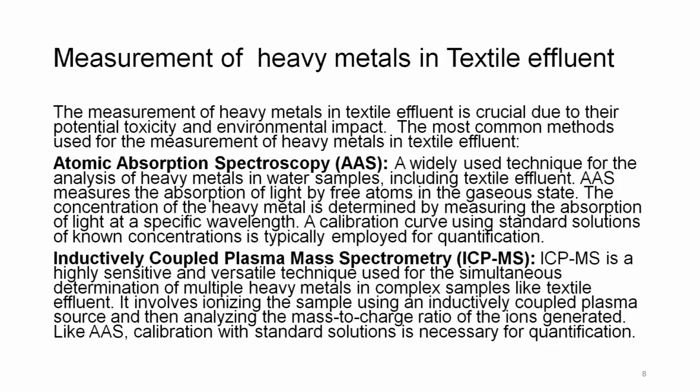And here let me add that the hollow cathode lamp of that element has to be used each time. The machine is calibrated with a copper lamp and copper solution, and then subsequently, one by one, the hollow cathode lamps are changed and other metals can be analyzed.